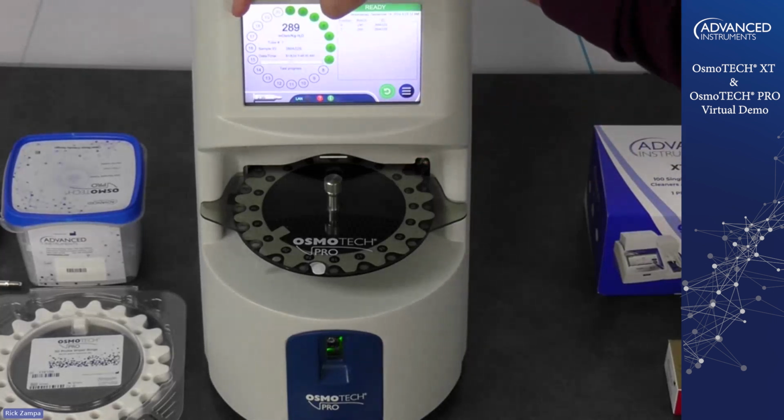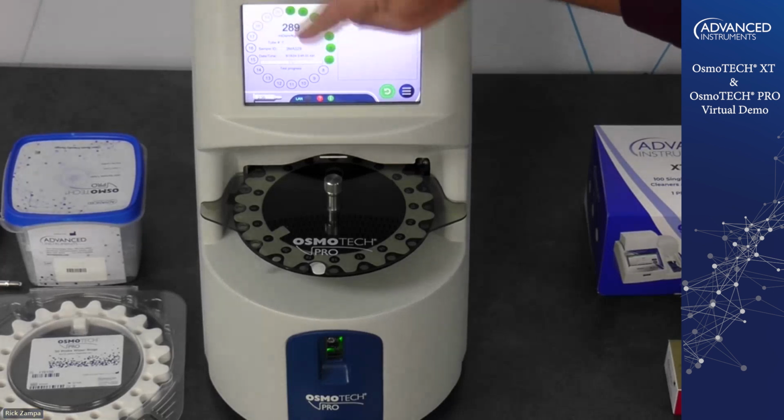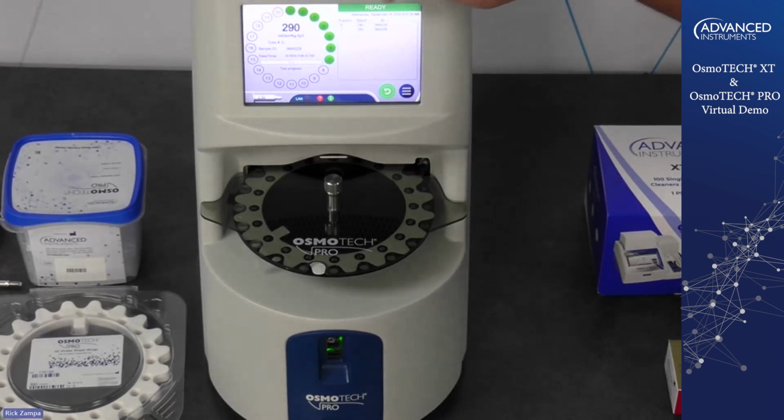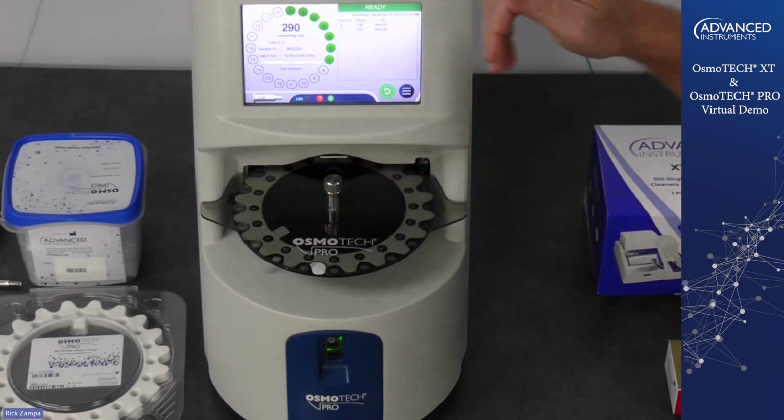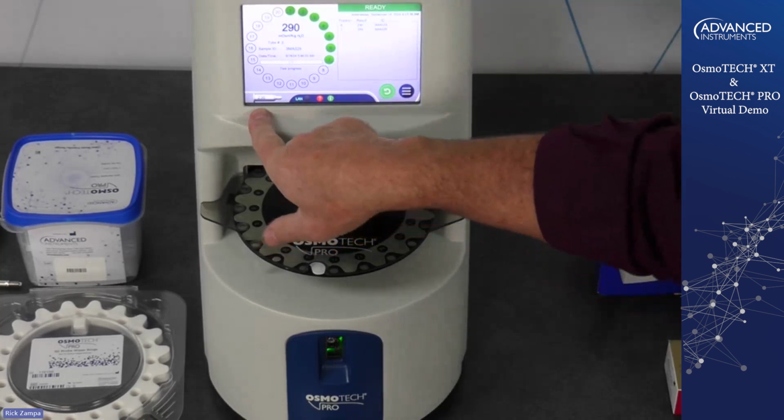The instrument, you can load up to 20 samples on the instrument at one time and run those 20 samples. You have each one of these buttons. You can look at the test result by clicking on the little button. You also have the positions over here that have been tested. You can see all the positions that have been used, so it always goes to the next open position for you. You have your counter of your consumables again.